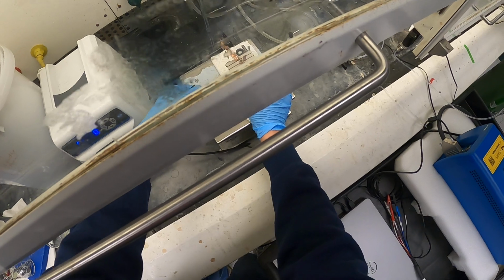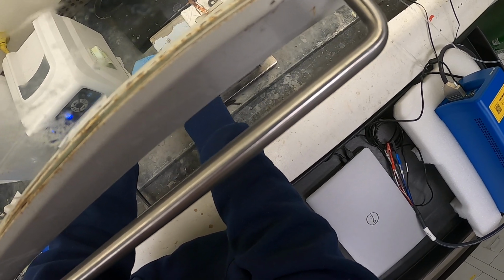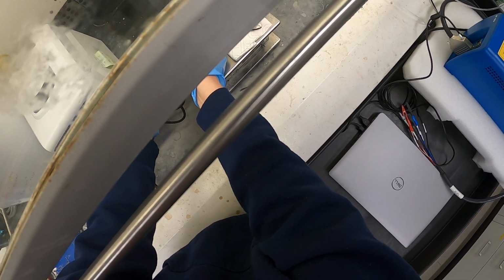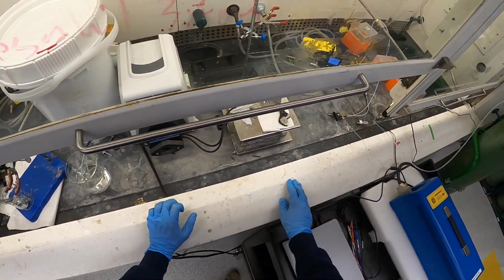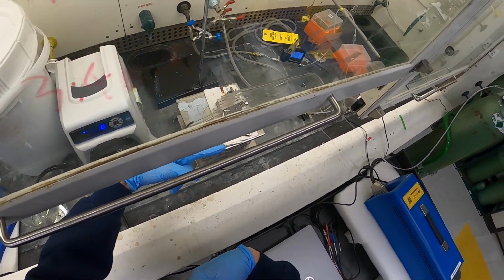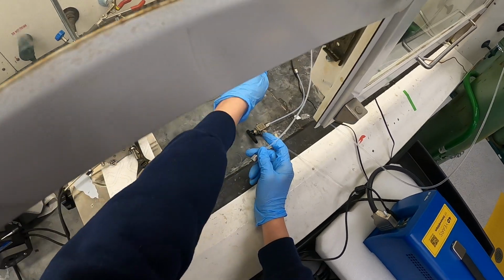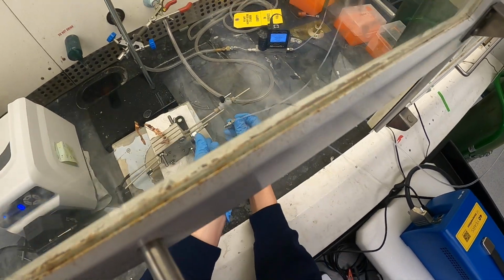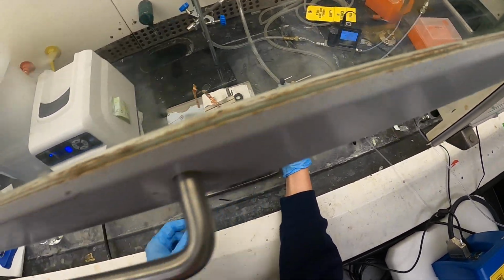So hook up electrolyte to the counter electrode here, and to our working electrode here. And now what we'll do is hook up CO2 flow. This is designed to be a cross flow cell. So liquid flows one direction, gas flows cross current to it. What I'll do is hook up the CO2 flow. Right now I have it set up to come out through this MFC from the wall. Add a little male to male or female to female converter adapter, and you're ready to go.